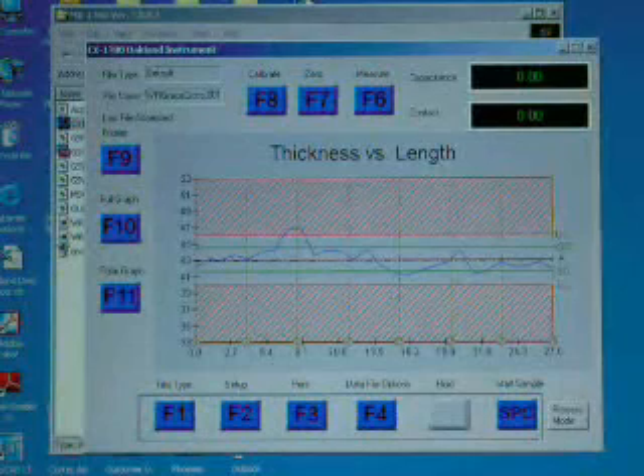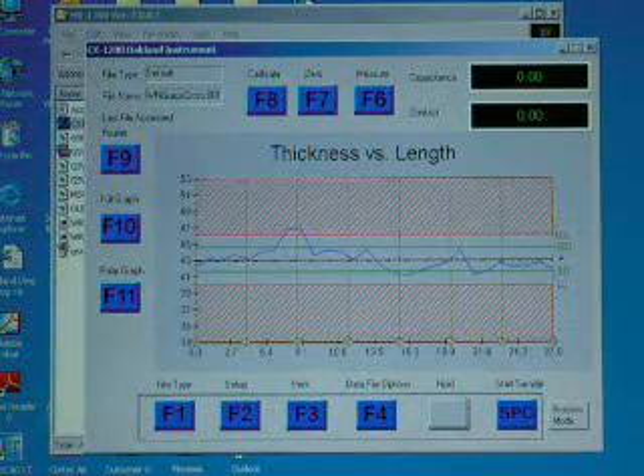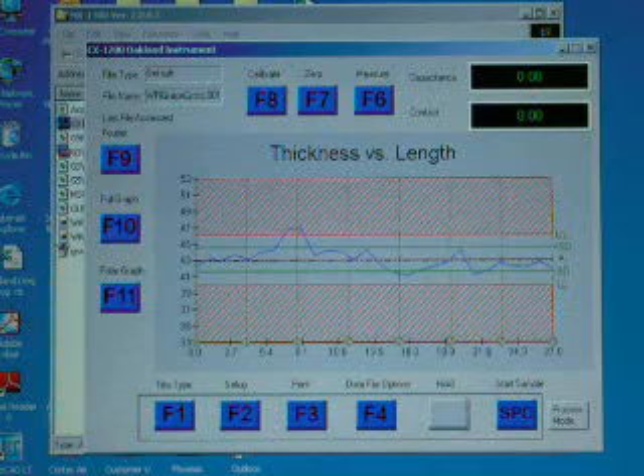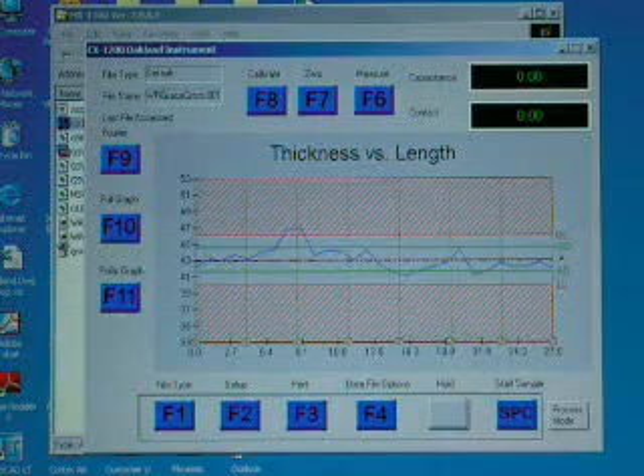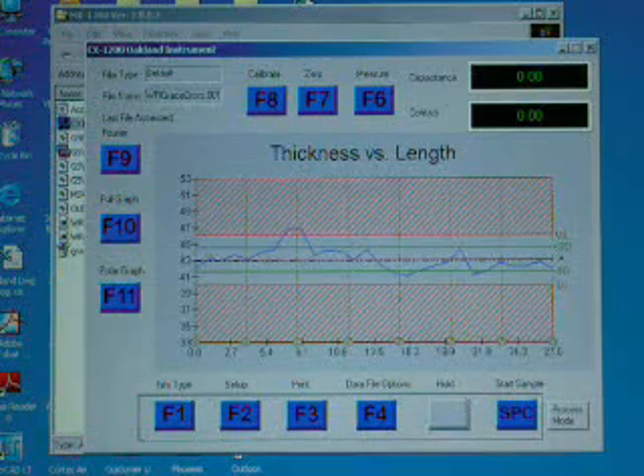After reporting the test data, determine and report the calculated high and low thickness values, range, and average, together with the standard deviation. Other useful reported values include range as a percentage of average and deviation as a percentage of average or target. Comparisons to preset upper and lower control limits are also useful for keeping your process within control. All of these are automatically calculated and reported by your MX-1300 quality control software.